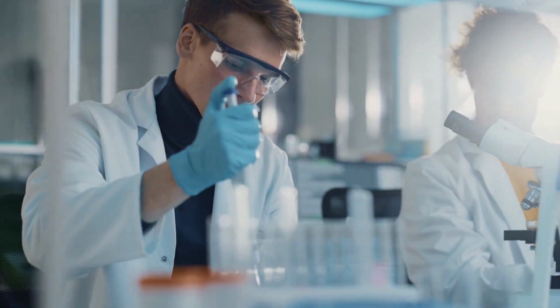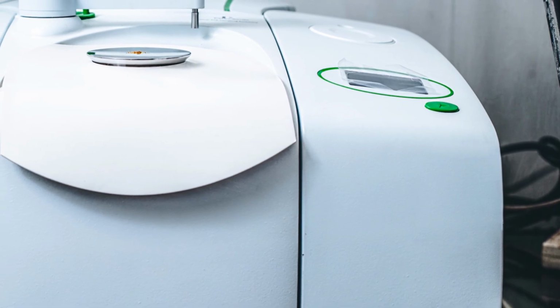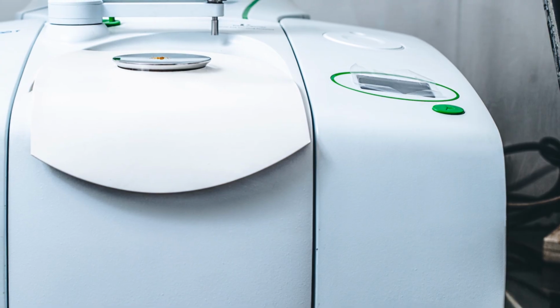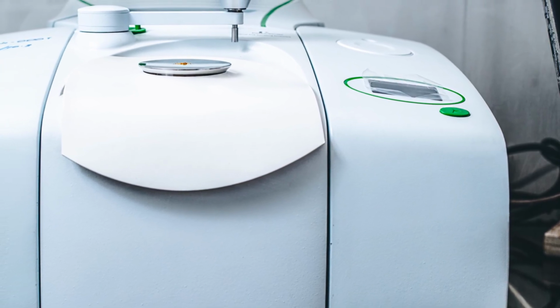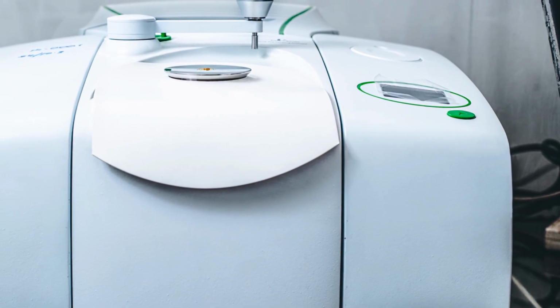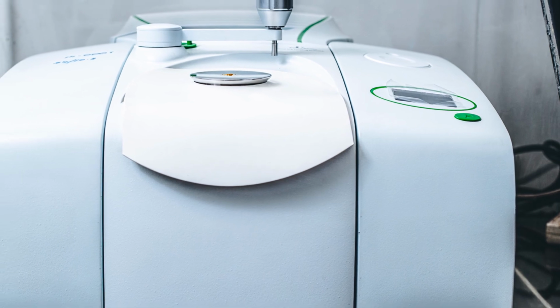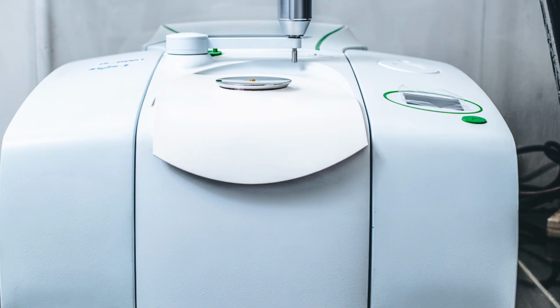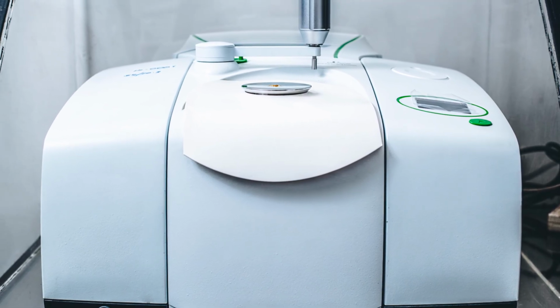In the end, the story of FTIR is the story of how a simple idea, interference of waves, combined with brilliant engineering in the Michelson interferometer, created a technique that is faster, more sensitive, more precise, and far more robust than older dispersive IR instruments. Instead of splitting wavelengths apart in space, FTIR encodes them in time and lets mathematics do the rest. That's why today, almost every modern infrared spectrometer you see is an FTIR.